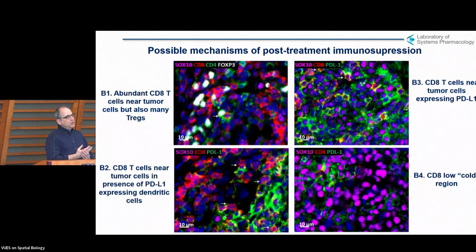And I'm showing you this to, again, point out not just the heterogeneity, but the fact that in almost all of this type of imaging, we have only a single snapshot in time. And one of the big challenges now is to try to figure out how to use things like temporal reconstruction or pseudo-time reconstruction, et cetera, to begin to get at the temporal series of an event that's going on here. And that's where I think increasingly mouse studies are going to be valuable to us, relating them back and forth to the humans, because in a mouse, you can get a more nearly synchronized response. But we don't have such data.